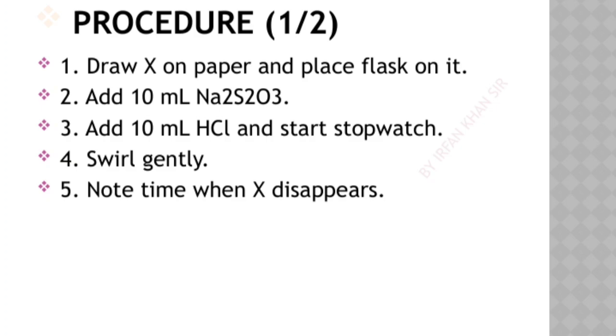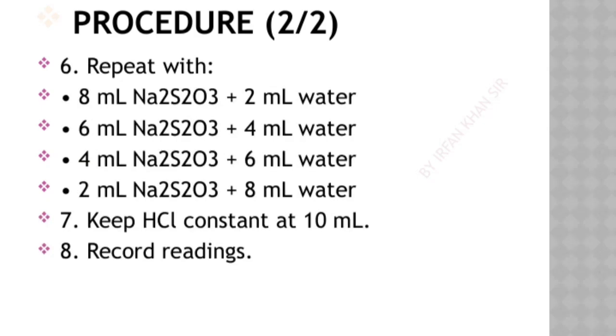This step is crucial because it allows us to measure the reaction time, which will be important for analyzing the reaction kinetics later on. Now, moving on to the next part of the procedure.